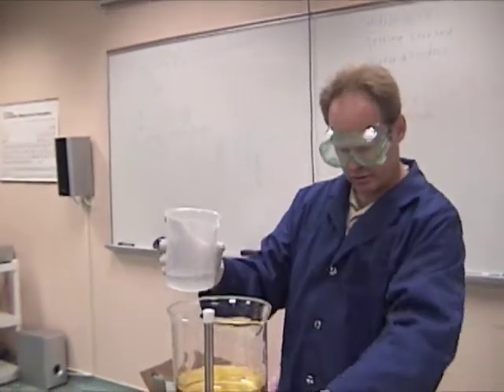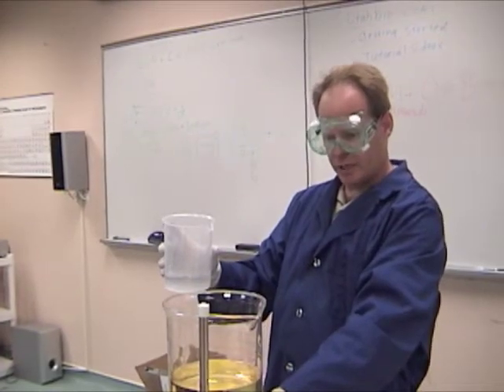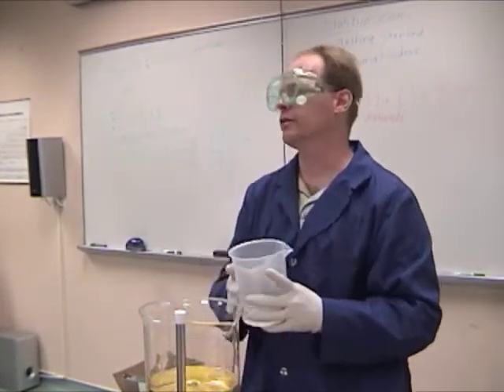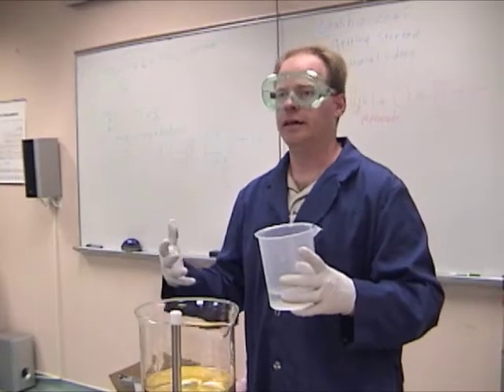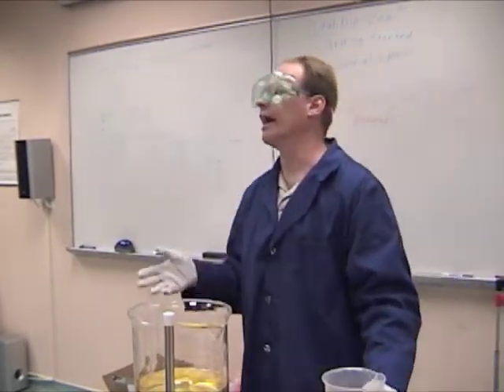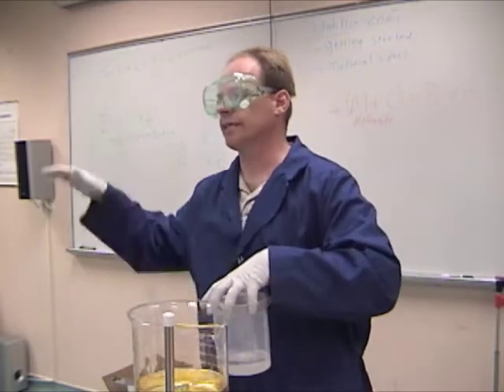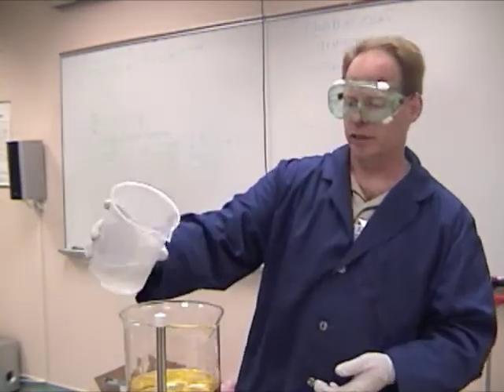And all I'm going to do is just... Where's the stir? Other side. There you go. This is just a magnetic stir. To make biodiesel, I need nothing more than heat and mixing. This is a heater. It's also a mixer. I can do this on a stove. This is why people can do it in water heaters, in anything. If people say, well, my water heater, my processor is the best. Yeah, right. All I need is something to heat it and something to mix it with. Some just have really expensive ones. Some have basic things. I can do it on my stove. I'll show you what this looks like here.